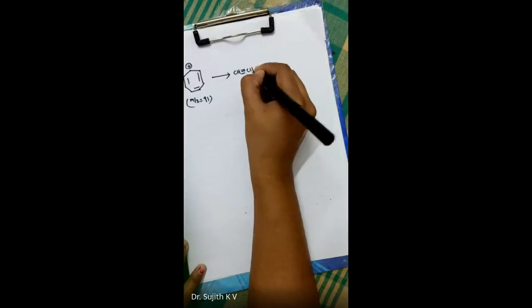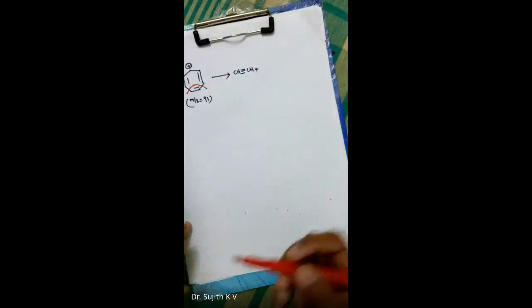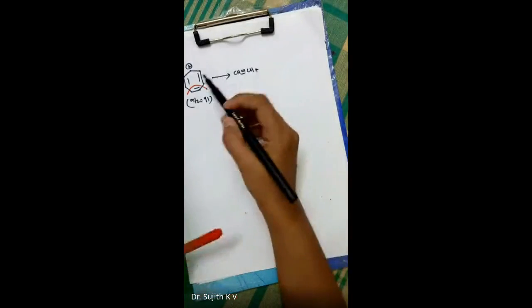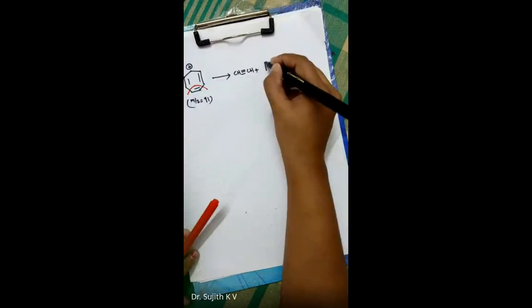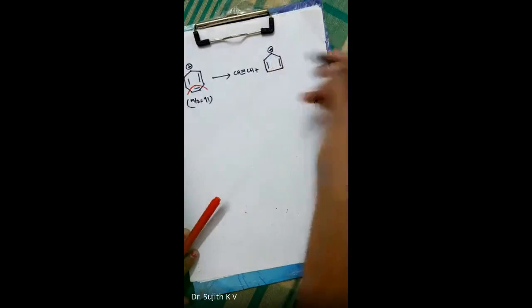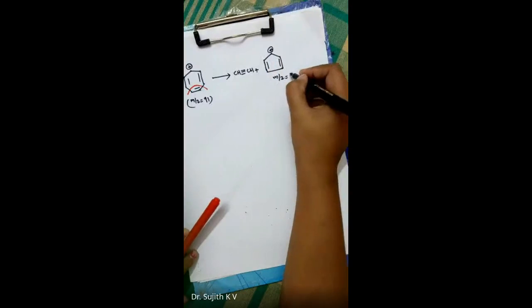CH triple bond CH, a complete acetylene molecule, is expelled, and the remaining one you can see here. I'll show you how it is expelled. See, from here an acetylene molecule gets eliminated. This is a 7 carbon system, 2 carbons went, and the rest will be a 5 carbon system. That is also, it will be like this. Okay, and the m/z value of this species is 65.